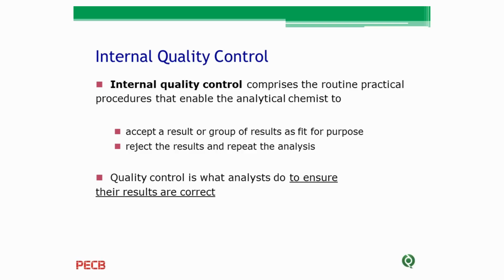When you participate in proficiency testing, as you know, you compare your results with other laboratories. An independent organizer, sometimes an accredited one, organizes such a program in order to let you compare your quality with other laboratories in your industry to see how valid your results are.